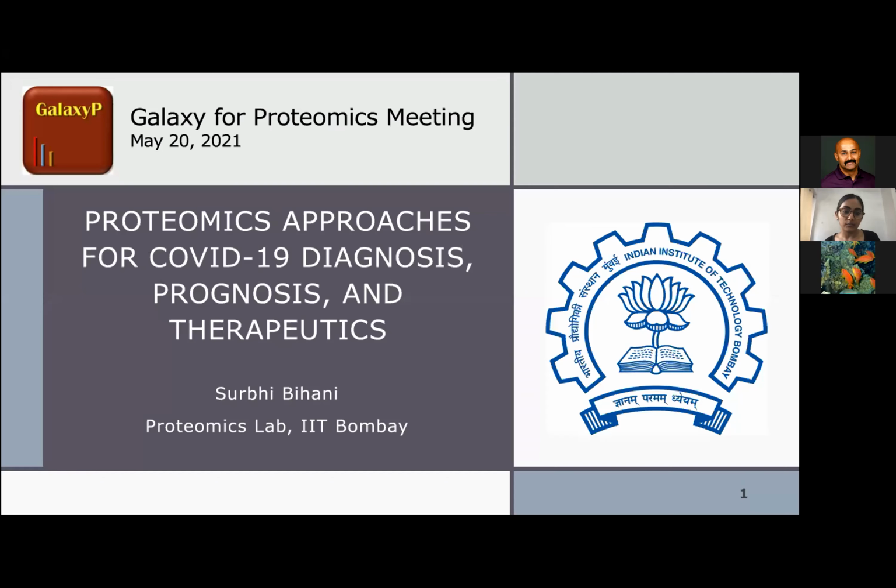Work that we have done and some of the work that we aim to do, mostly mass spectrometry based proteomics. So this would be proteomics approaches for COVID-19 diagnosis, prognosis, and therapeutics.